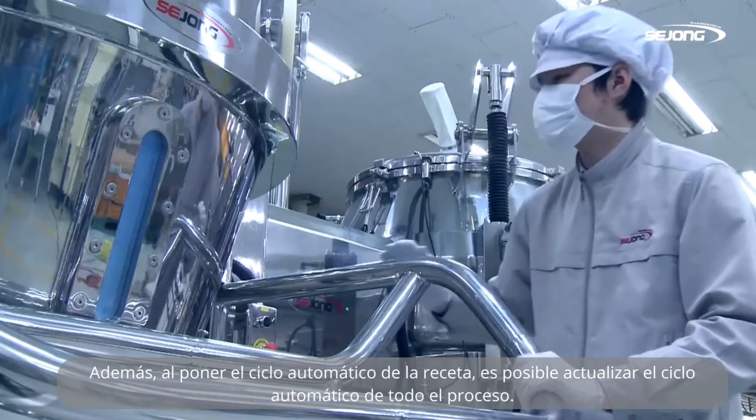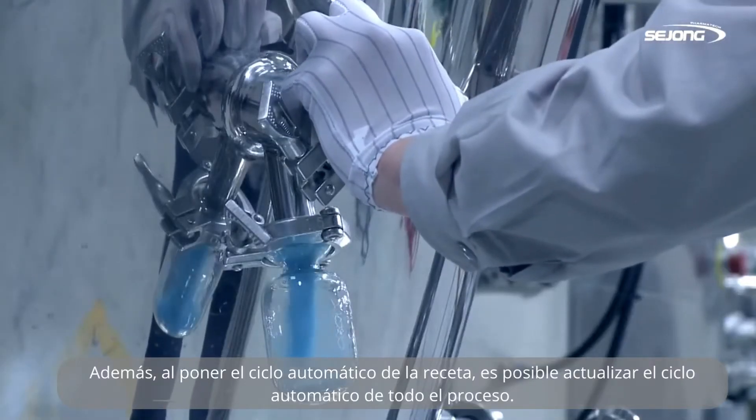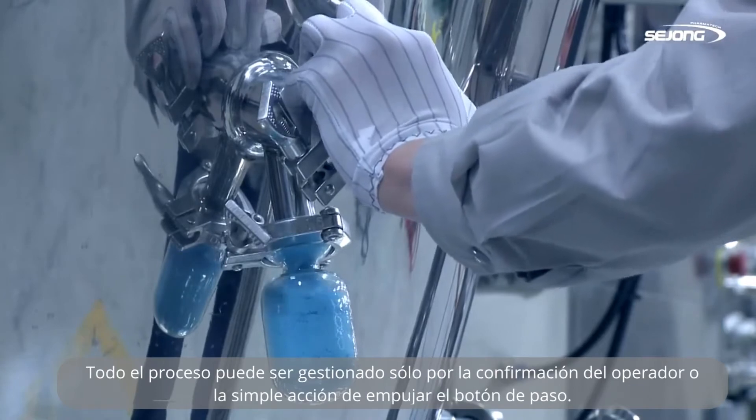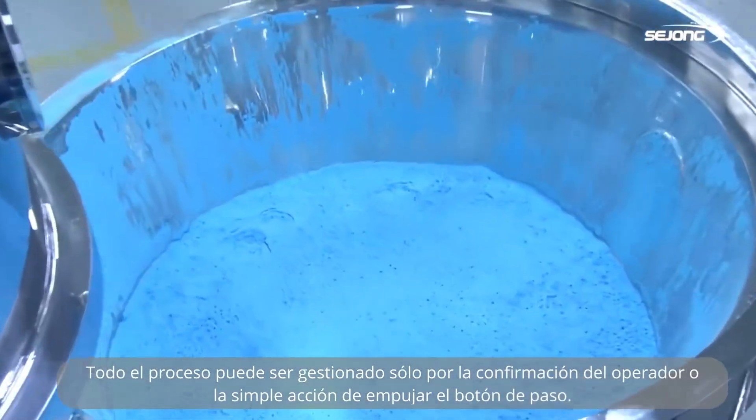By inputting the automatic cycle of a recipe, it is possible to actualize the automatic cycle of the whole process. The whole process can be managed just by confirmation of the operator or the simple action of pushing the step button.